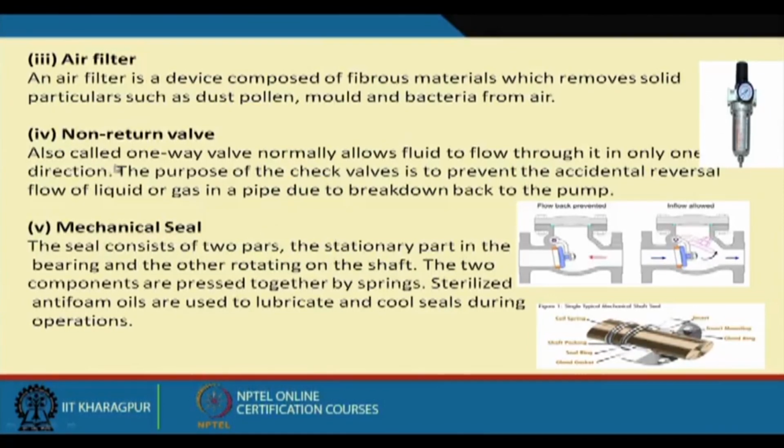The non-return valve, also called a one-way valve, normally allows the fluid to flow through in only one direction. The purpose of the check valve is to prevent the accidental reversal of flow of liquid or gas in a pipe due to breakdown, back to the pump.